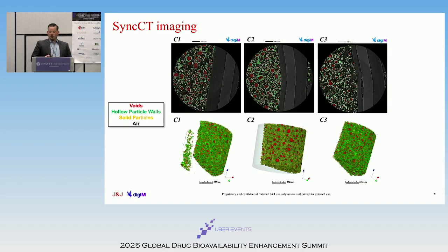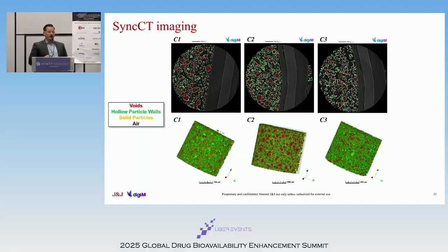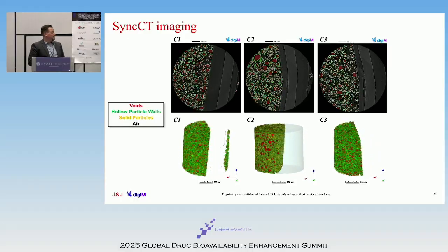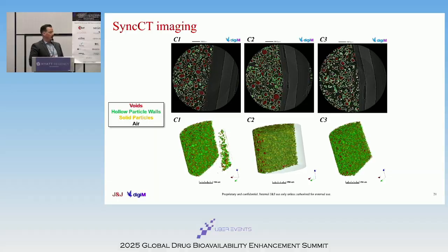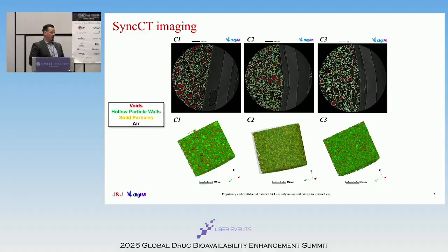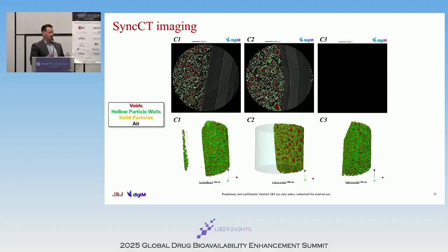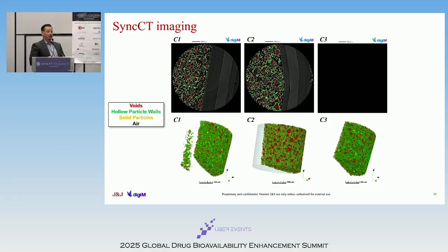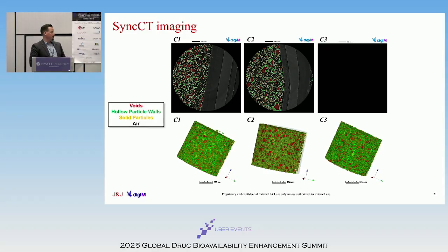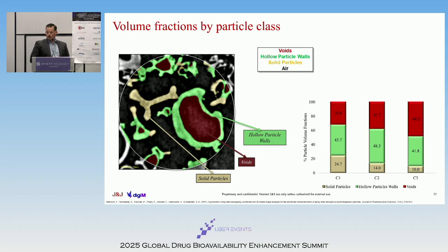And then this is what those images look like once we image these with Synchrotron and do image analysis. These were imaged at 300 nanometer resolution. So we're capturing tens of thousands of particles in the field of view at ultra high resolution. A lot of the images I was showing you before are grayscale. But where this gets exciting is when we can actually quantify things. All the color you're seeing here is from advanced image segmentation. We can iteratively use machine learning and deep learning to color in every single pixel and assign it to a phase. And then we can take that a step further and use a technique called watershed to separate every individual particle. So now on a per particle basis, we can do endless quantification.